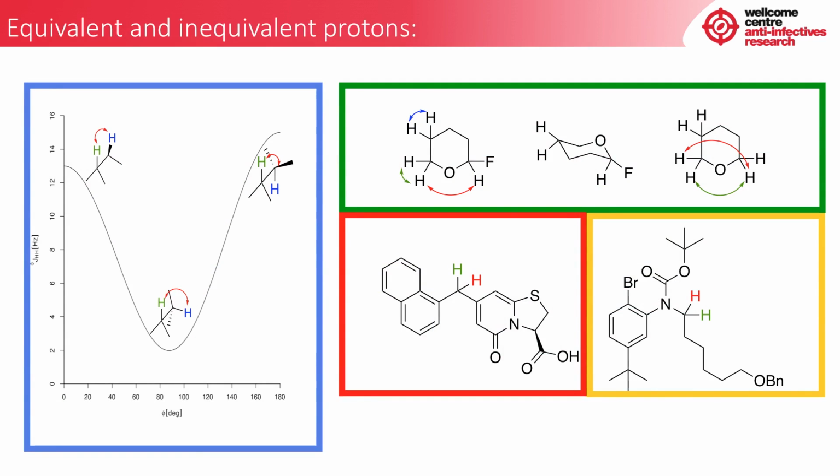And this is where we touched on this before. Our rotating alkyl chain here has various potential coupling constants depending on the angle. But in reality, it rotates too quickly, and what we see is an average with a J value somewhere around 7. This is only true because it's free to rotate, however. If we locked it, the story would be quite different.